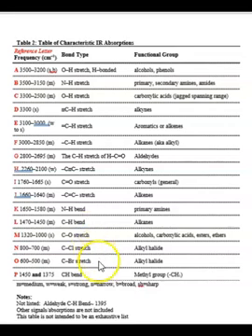We don't see these halide groups here like the chlorine and the bromine. You'll definitely see the CH bend. In another example, you'll see this one a lot, between 1000 and 1320. And two of the most common ones would be the C double bond O, called the carbonyl, although some people call it the carbonyl group. I've seen it called carbonyl. And then up here, alcohols and carboxylic acid are also very common.